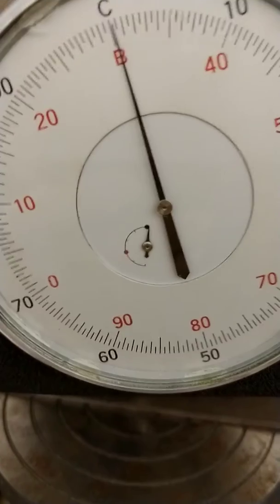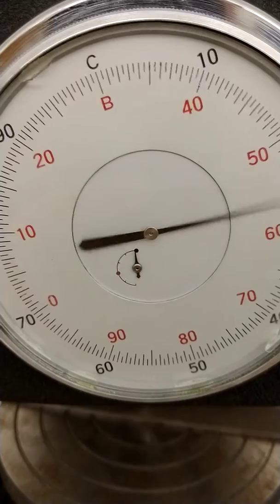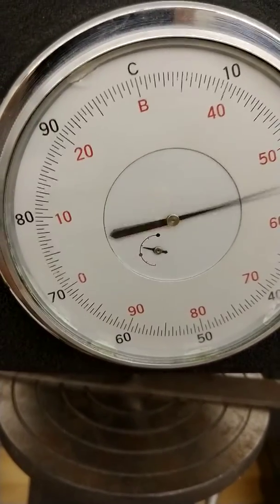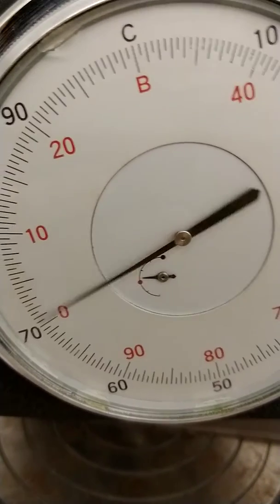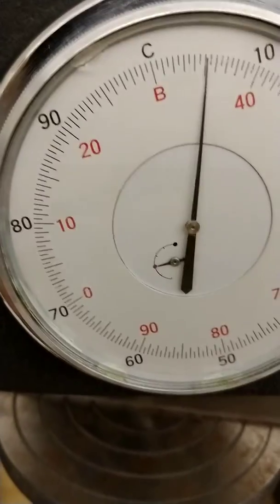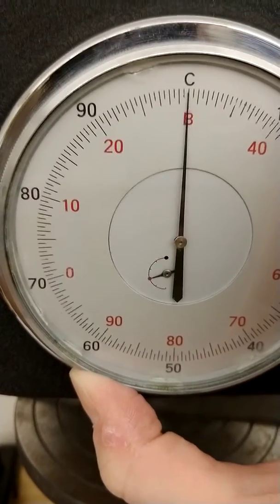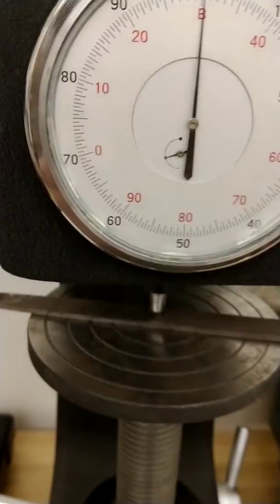I'm turning very slowly the hand wheel. You can see that small dial is moving — I just went around once, just went around twice, and I'm reaching the red dot. I want to bring this up as close as I can to the B and the C. I kind of went by there a little bit — that's okay. That's my preload. I'm just going to readjust my dial now so that those are lined up. That is not a hardness reading at that point; that is just the preload.